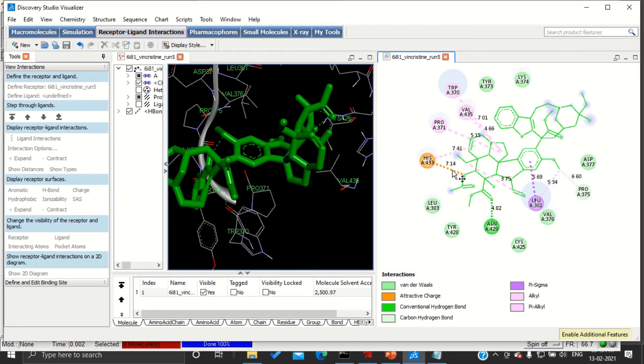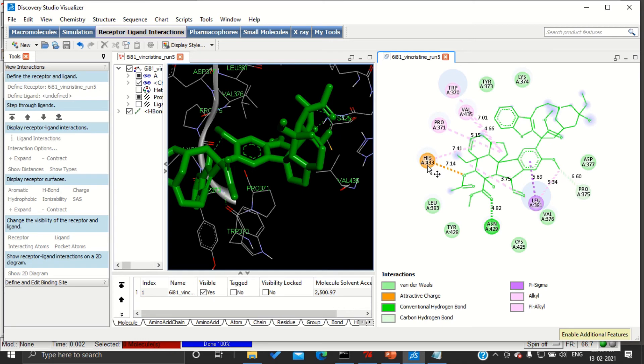Here you can see the distances in angstrom units. So the distance between this oxygen and histidine at A chain 433 is 7.14 angstrom units.